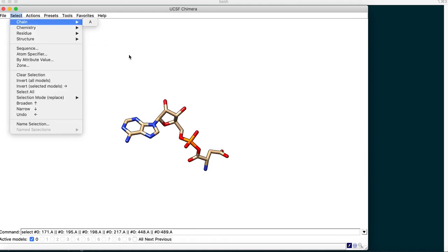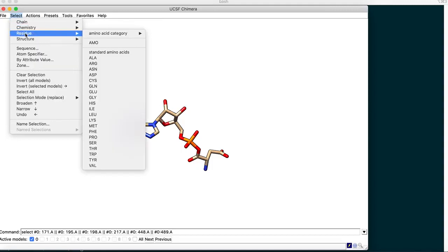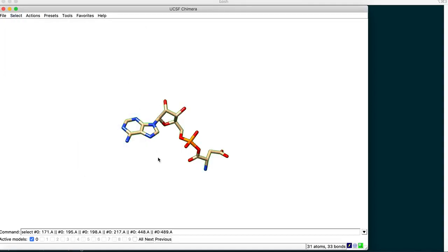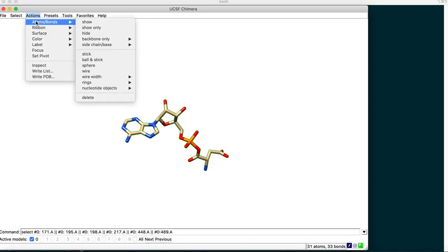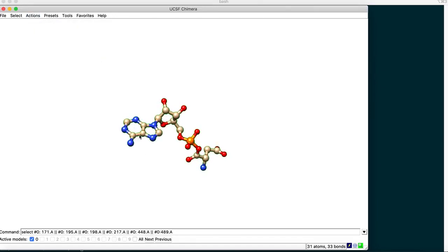Although we are only displaying the ligand AMO, the rest of the molecule is still intact. Every time you operate on this molecule you have to highlight it first. Go to Select, Residue, then AMO - it's highlighted again. Now change the representation to Ball and Stick: go to Actions, Atoms or Bonds, pick Ball and Stick. You see a beautiful ball and stick representation with atoms as balls and bonds as sticks.